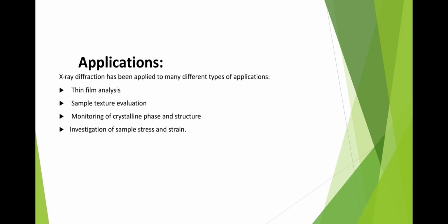applications. Firstly, it is used in thin layer and thin film analysis, then sample texture evaluation, monitoring of crystalline phase and structure, and investigation of sample stress and strain.